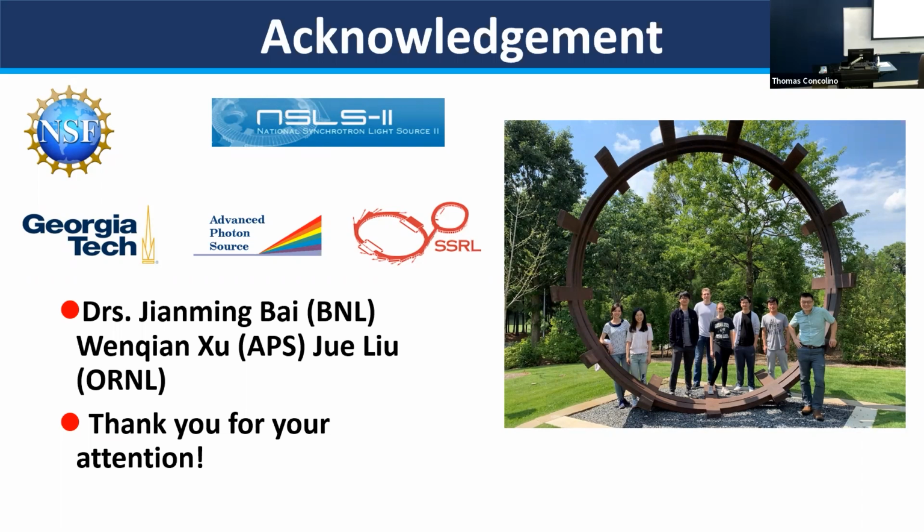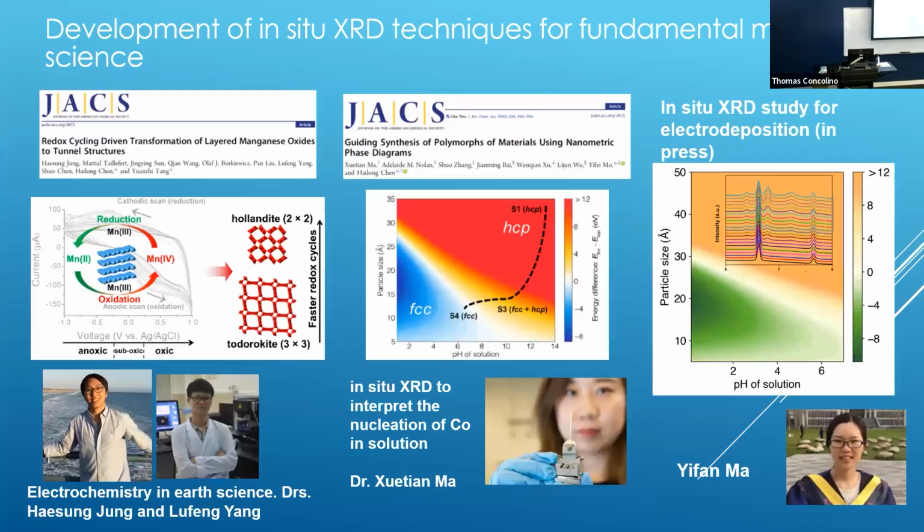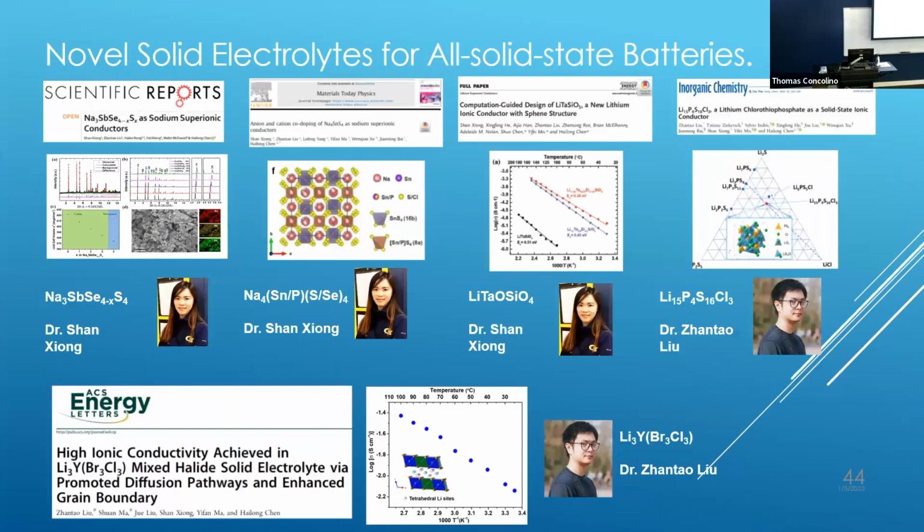So which one is it? Battery materials, or the first one you showed, the one which is not solvothermal, the oxygen? The battery materials? Yeah, the battery material. Oh, it didn't take 2 weeks. If we do it at a synchrotron, it is as fast as we want, hours.